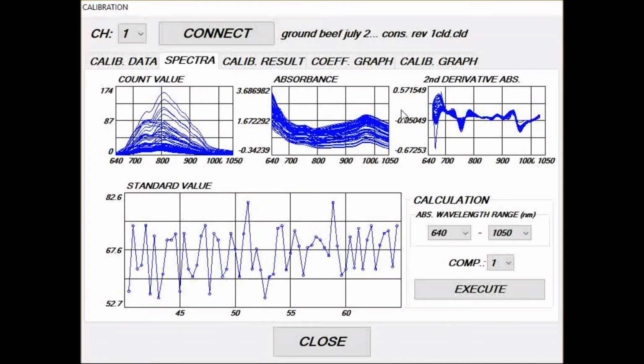And the next step would of course be to find the outliers, go back, and reduce without them, as we do normally. There is no real way to OWLS these as we do in ours, and I don't think there's a good way to reduce with repeatability in mind. We might be able to work that into subsequent versions of the software. In the meantime, loading up the values that we just saved earlier will be shown in another video. Thank you. I hope this has been helpful.